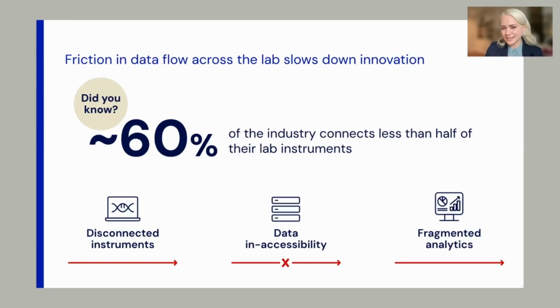with fragmented analytics. Our scientists, of course, like to use the latest and greatest of tools in their research, which is wonderful, but especially with the advent of machine learning and AI and all of these different ways of analyzing things, there are so many tools to choose from, which means that the way you gather insight from your data is becoming greater and greater and more fragmented over time. Combining that with this manual step of having to copy data from one tool to another, one device to another, you lose that data lineage.